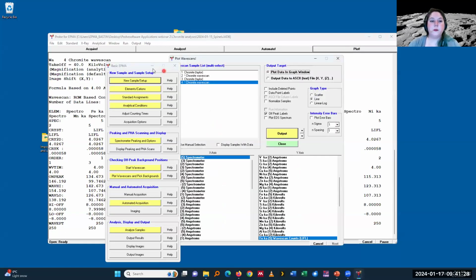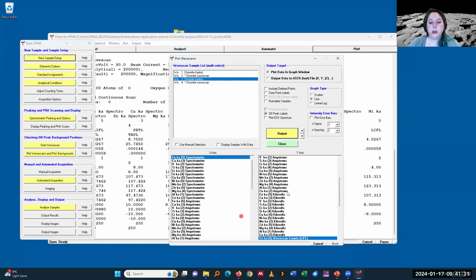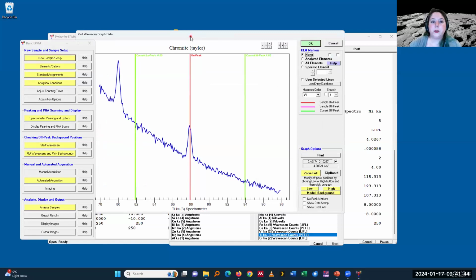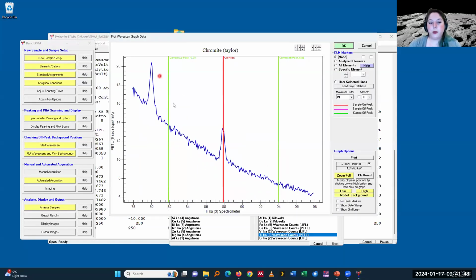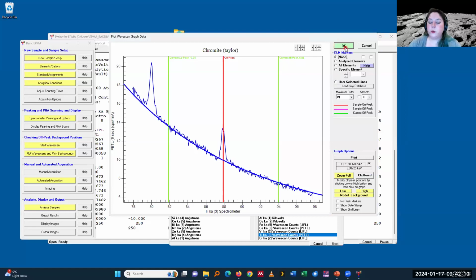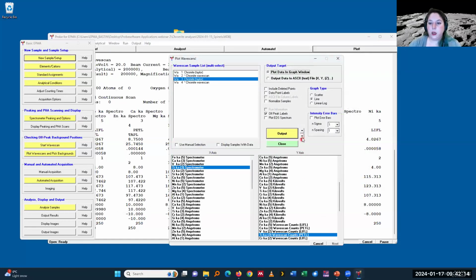And then when I look at the plot window and want to fine tune my analysis, again, this is something that Julien will probably show you much more. I can look, and for example, with titanium, in terms of high precision, high accuracy, I see the wave scan. Here's my titanium peak. I can model the background. And you see, when you have a linear background, you're actually cutting out, I don't know, 15% of your intensities. So that's where the different backgrounds can really come in, and you can optimize that and have it assigned to setups as needed.